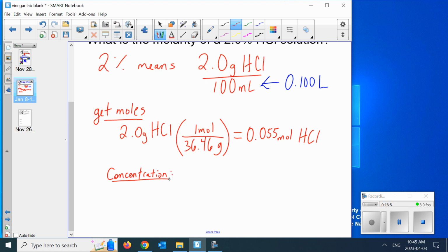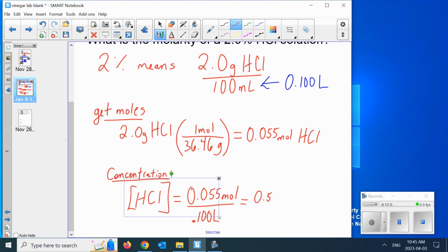So that 2% solution is really something that we use in chemistry. Moles divided by the 0.1. We were assuming that the top 100 mils was 3 significant figures. You can actually measure more. And the math there is pretty easy. 0.055 divided by 0.1 is 0.55. Right again. Okay, well, trust me. Okay.